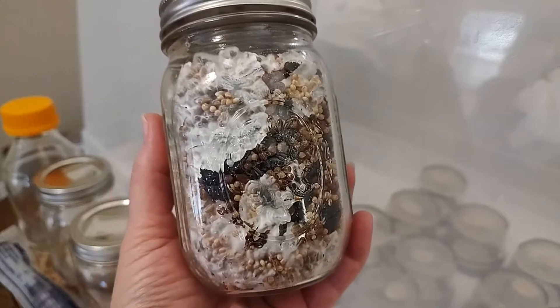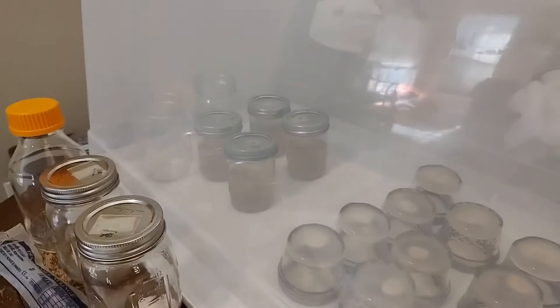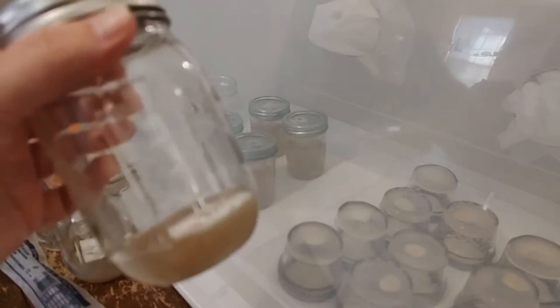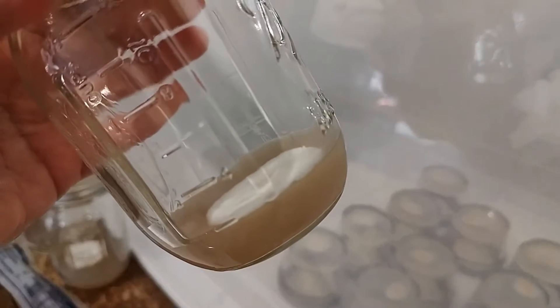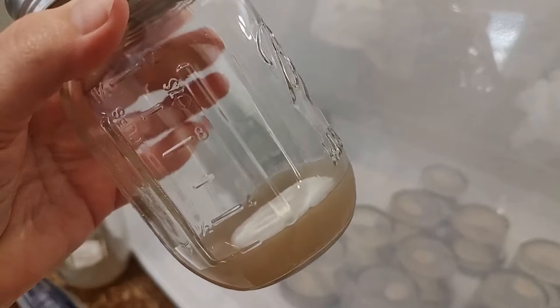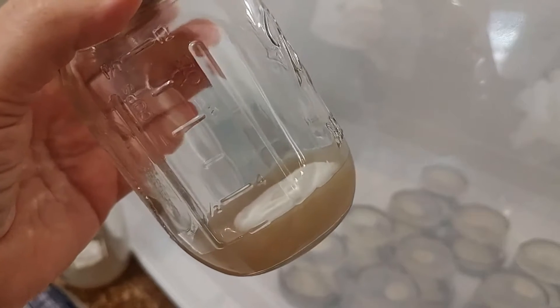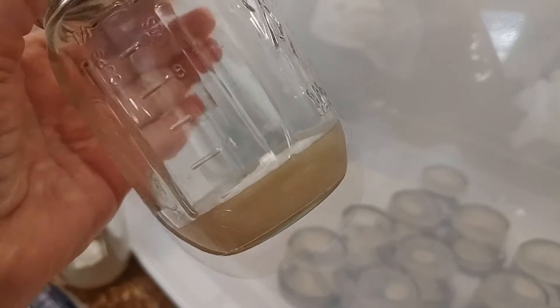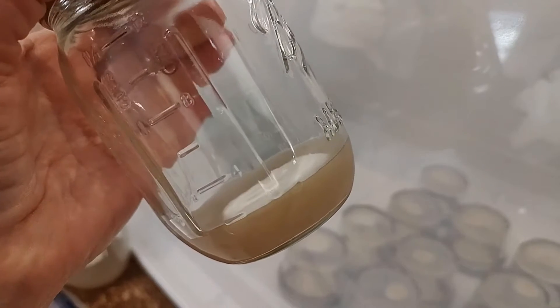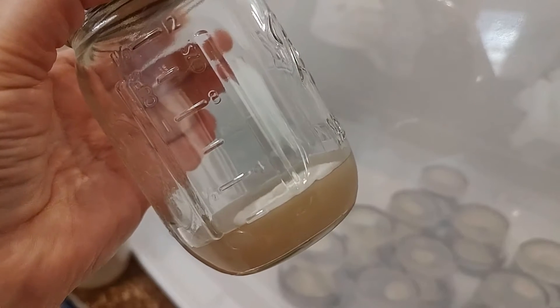I really want to talk about spores versus liquid mycelium. Whether we're talking about LCs, which are here in the still air box, liquid cultures, or slurries which we're creating here — it's the idea of creating liquid mycelium versus working with spores.